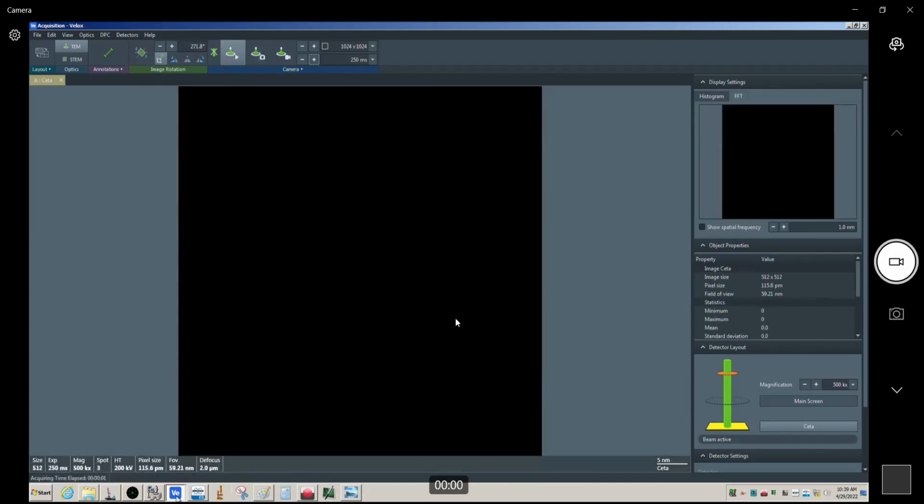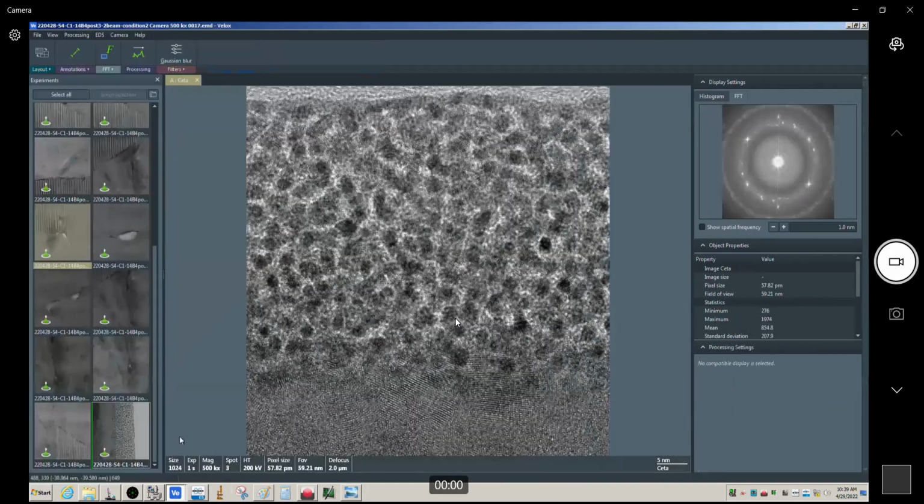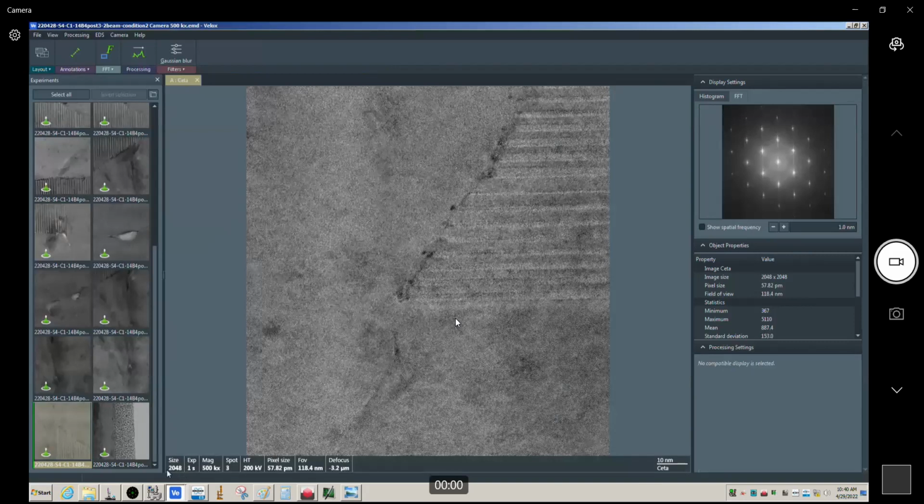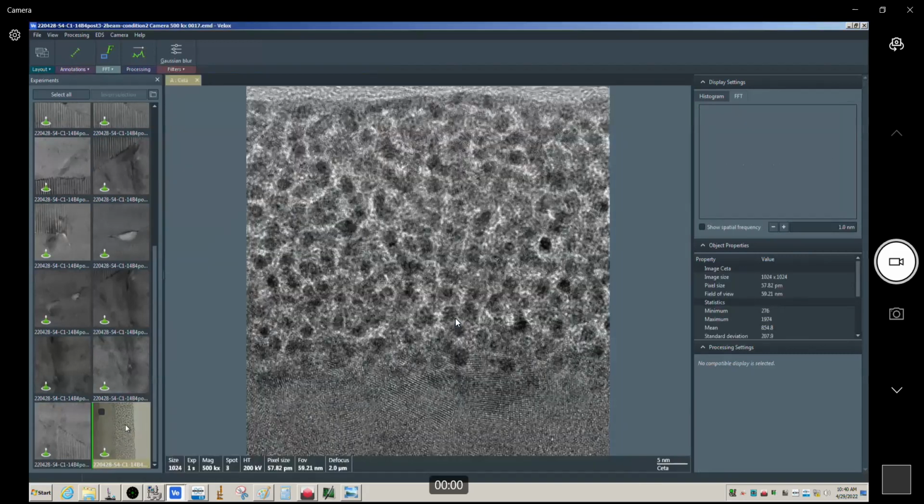let me go to the processing window. Now when you acquire it, you're going to see that it's 1024 by 1024, whereas the full frame was 2048 by 2048. To confuse matters more, the thumbnail here shows how it would look with full readout area and 0 rotation. I don't know why it does that, but it does.